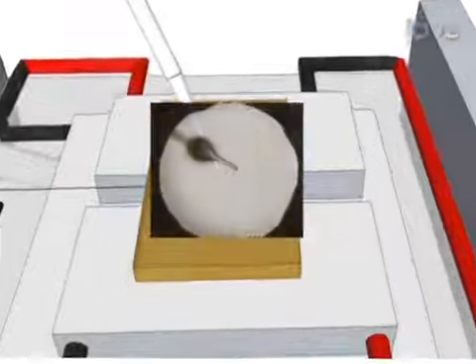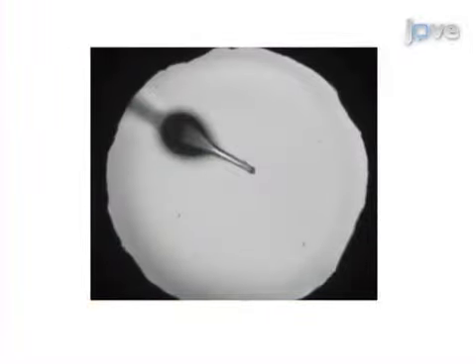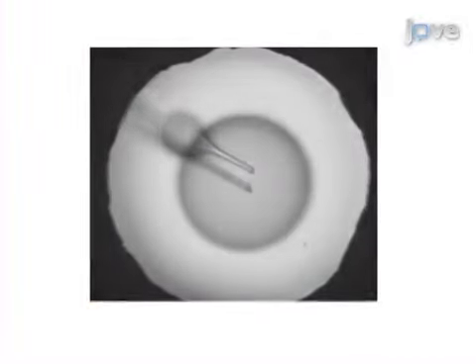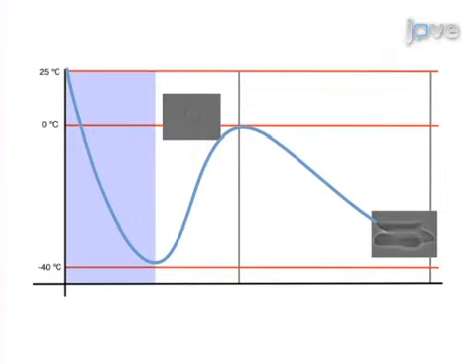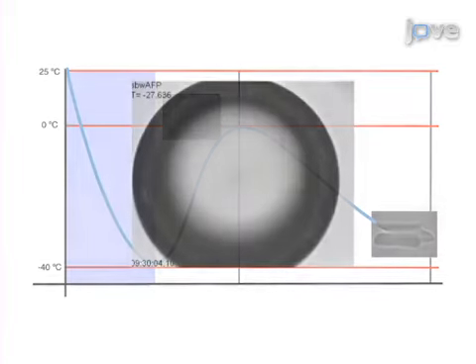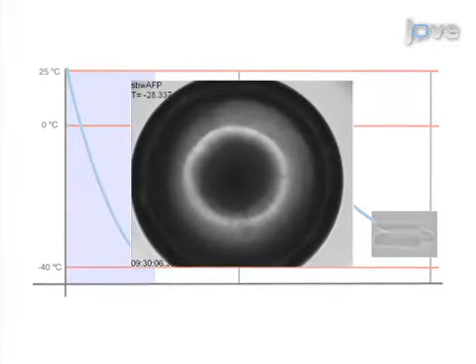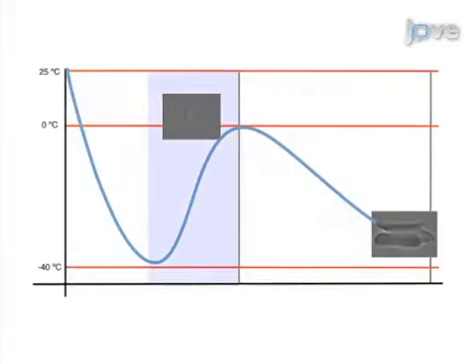The capillary tube with sample is then placed onto a temperature controlled stage. The second step is to freeze the solution by cooling it to low temperatures in order to introduce ice into the drop. Next, the drop is warmed to melt most of the ice in order to maintain a single crystal in the drop.